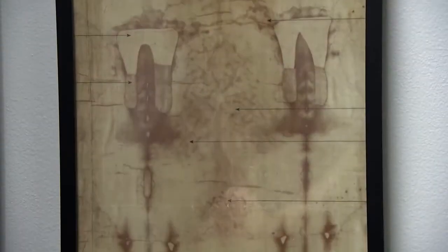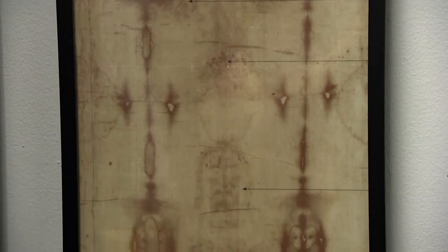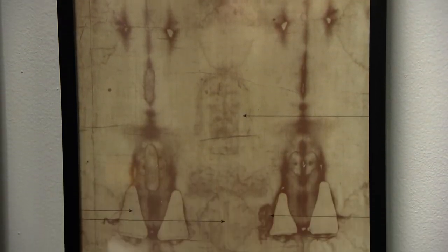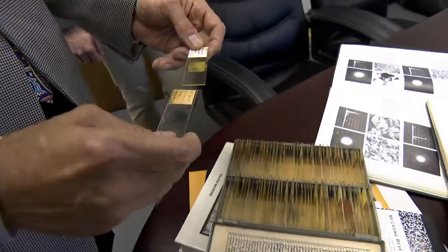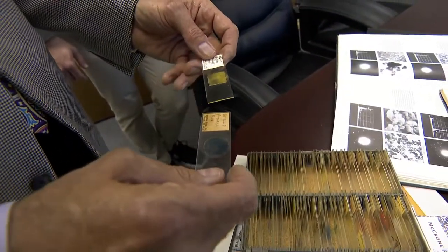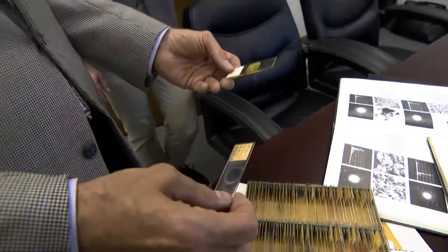Among the high-profile pieces McCrone put under his microscope, the Shroud of Turin, the alleged burial shroud of Jesus stained with marks that devotees claimed was blood. His conclusion was that there was no blood, that these were a pigment, in fact, red ochre. To trained eyes like McCrone's or Laughlin's, two colors that might appear identical on canvas look very different under a microscope. Take French ultramarine, for example.